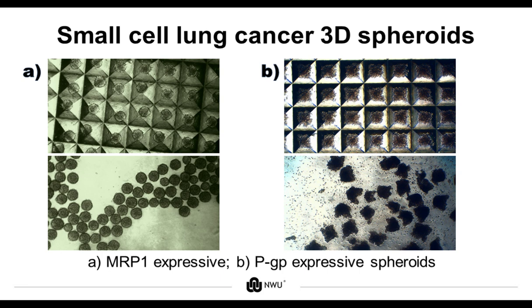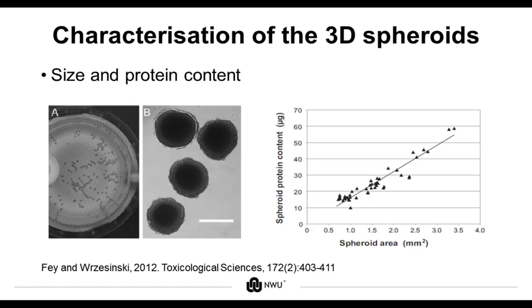The PGP expressing cell line also formed spheroids, although not as flawless as the first one, using the same seeding concentration in an Agrewell 400 plate. However, the incubation period had to be prolonged to 48 hours. The chemosensitive line is still giving us a bit of a problem, as the cells tend to clump as soon as they are transferred to the bioreactor. But we are busy testing other method modifications at the moment.